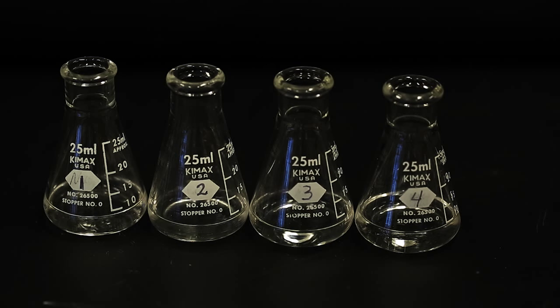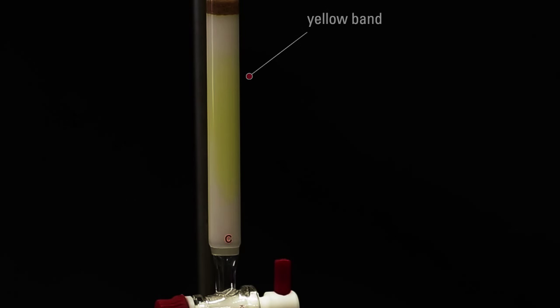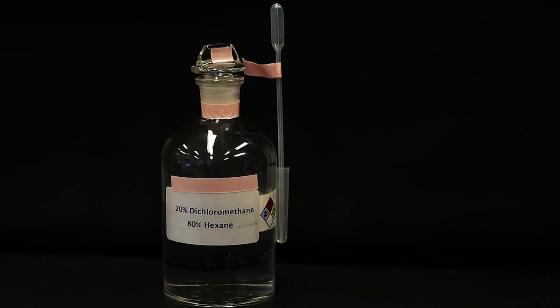After the collection of four fractions, you can see that the yellow band has moved about one third of the way down the column. At this point, increase the polarity of the solvent to elute the yellow band more quickly. Change the solvent to 20% dichloromethane, 80% hexane.